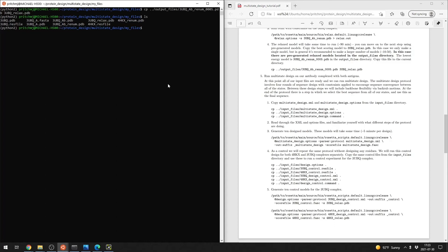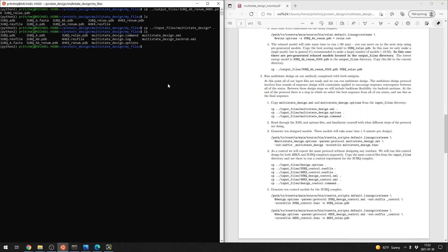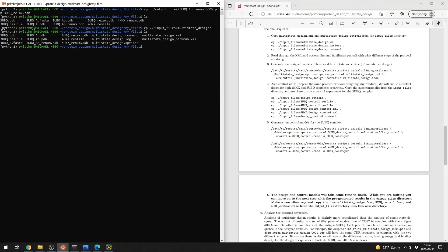Next we're actually going to run the multi-state design. We copy a few files — you'll need the design XML and the multi-state design options file. We're going to do both a design and a control phase, as in the single-state portion of the tutorial, taking about five minutes per design. We bypass the generation here and go straight into the analysis portion — 10 design and 10 control models.